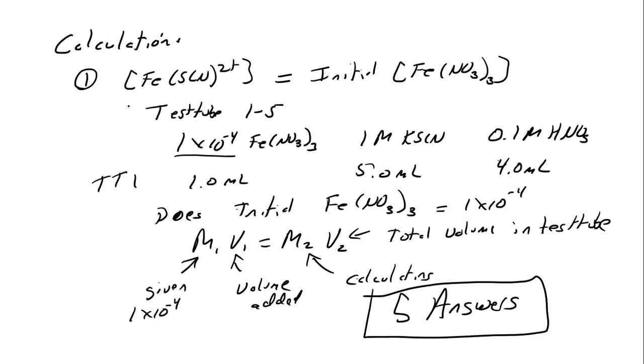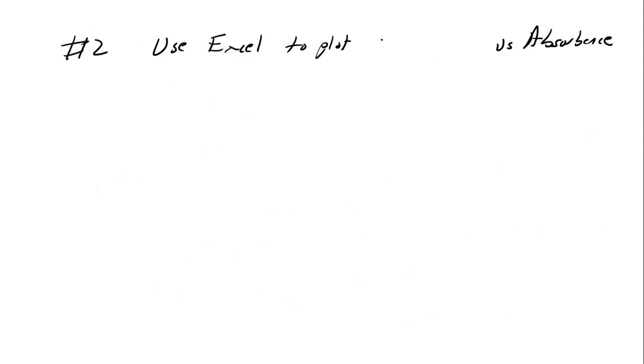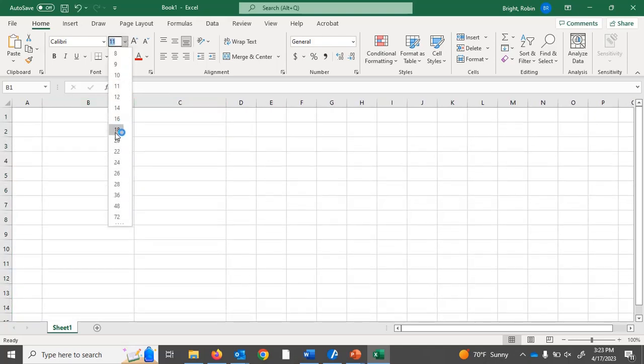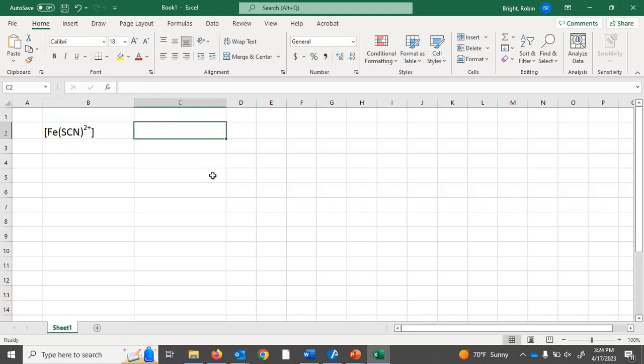Because technically we did the FeSCN here. So number one we found FeSCN. So I can change that. So I'm going to make up numbers. And three columns, I just need two. I want them to be big. So I'm going to have the blank FeSCN 2+ that. And Excel's a little harder but you can superscript it. And then I'm going to have the absorbance.